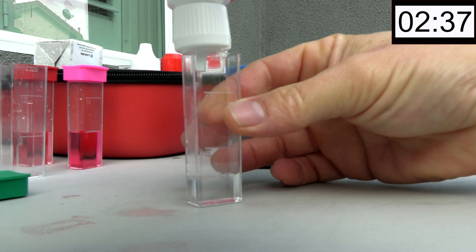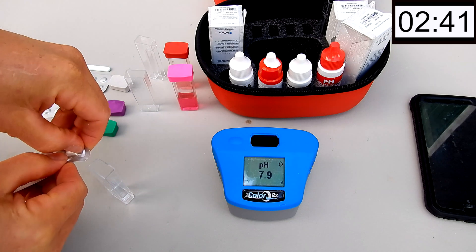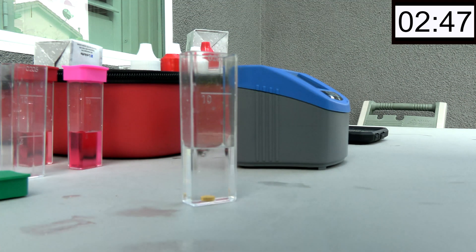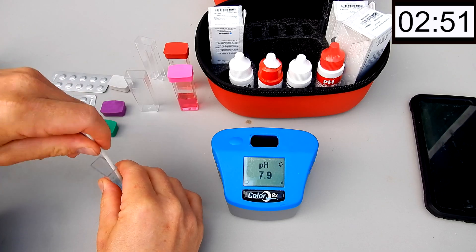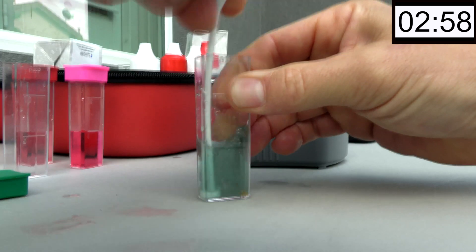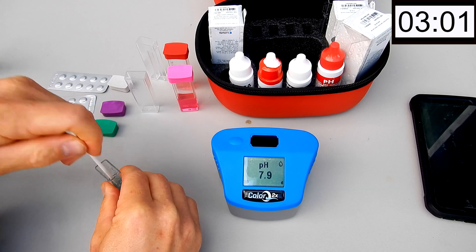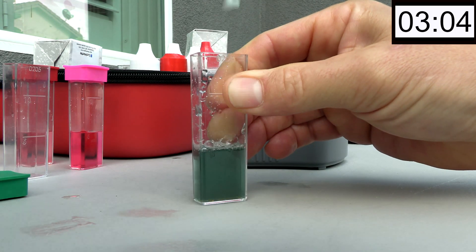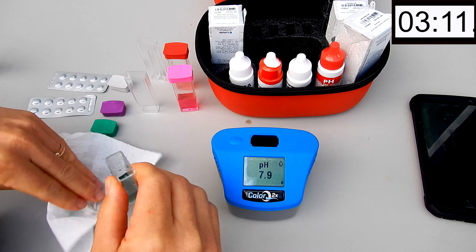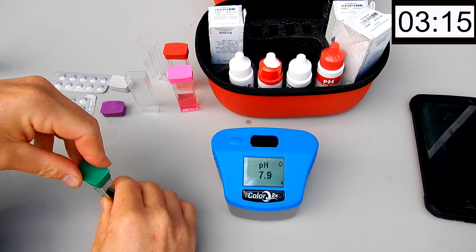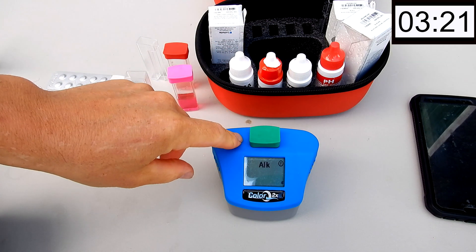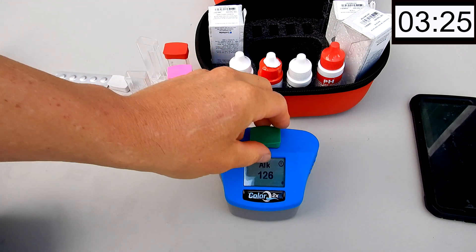The Alkalinity. And the tablets take a little bit of getting used to. You have to break them up thoroughly to make sure you get a good reading. I think LaMotte went with the tablets because they're more accurate in the long run and also the expiration date on the tablets is a lot longer. The tablet for the Alkalinity expires on 4/2023. Coming in at 126.